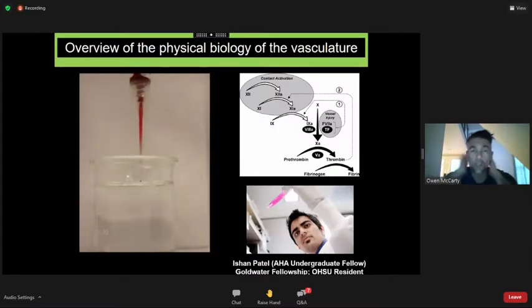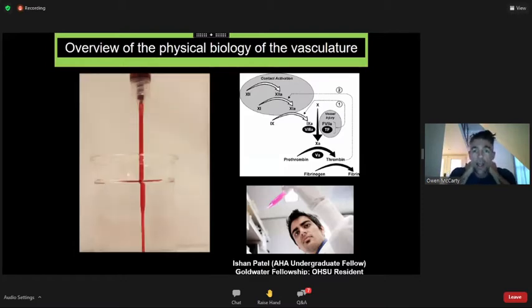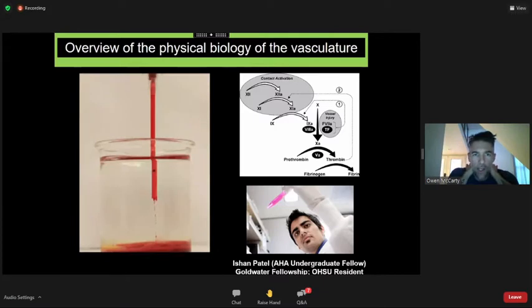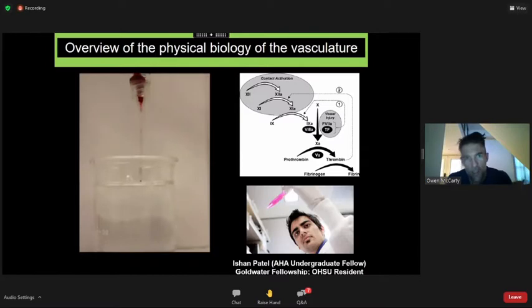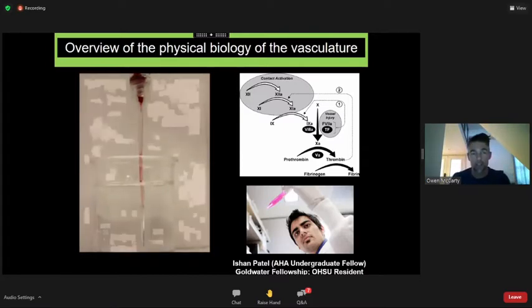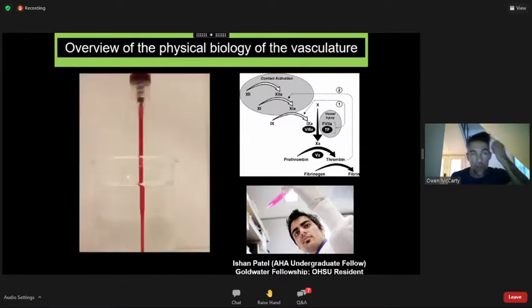Here's the next approach, and this is actually Ishan down here. He worked with me when he was a freshman. He went to undergrad at Oregon State University, in the chemical engineering department, and he worked with me as a freshman. He built this really simple model of how blood flow creates a clot in a little glass tube. And we used this to identify a druggable target that years later we've taken to clinical trials and shown that this drug may prevent blood clotting during dialysis.